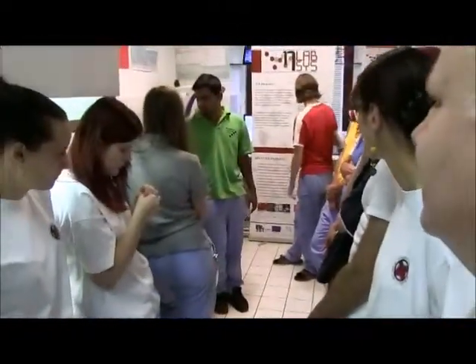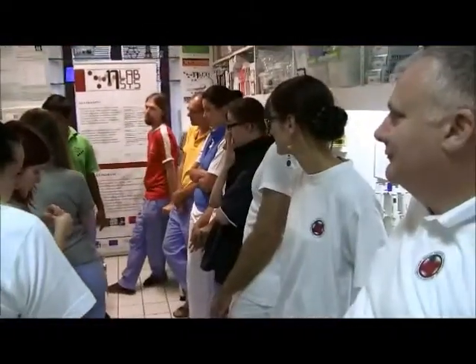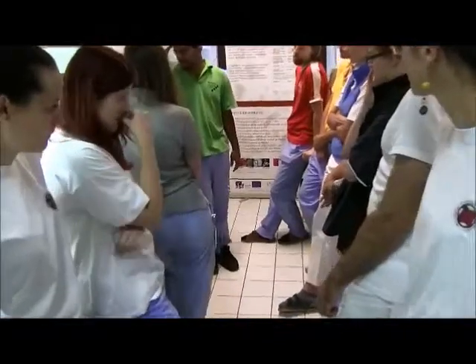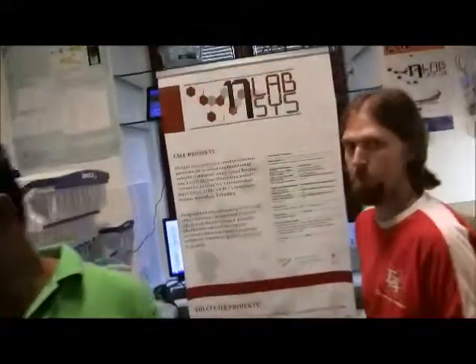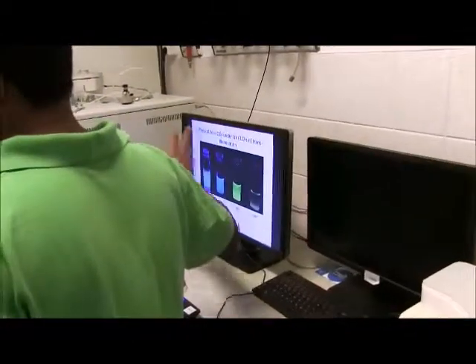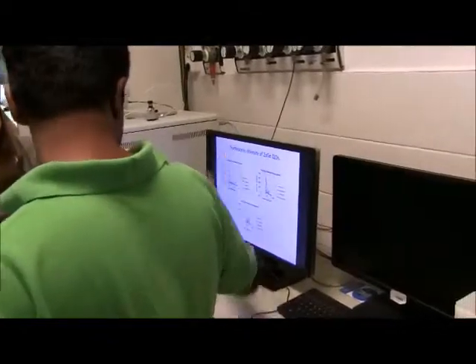At room temperature we can have a bluish color, at 60 degrees a little bit sky blue, at 80 degrees green, and at 100 degrees almost no color, a very faint green. From zinc selenium we cannot get red color. These are the fluorescence spectra and observed spectra.